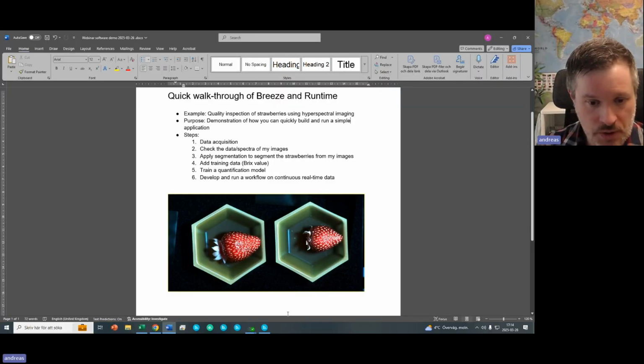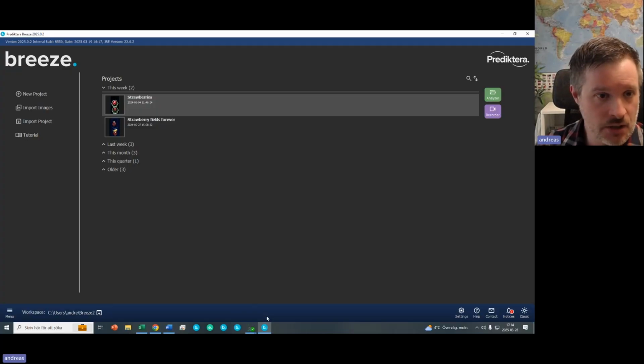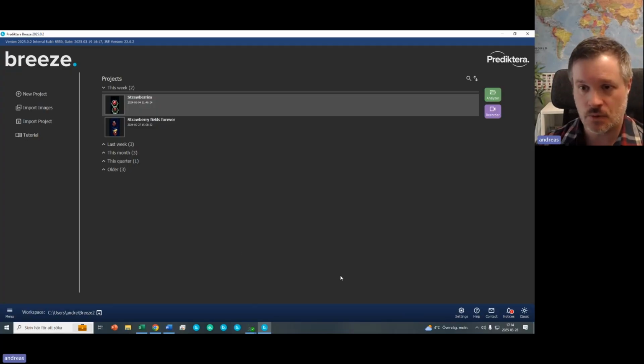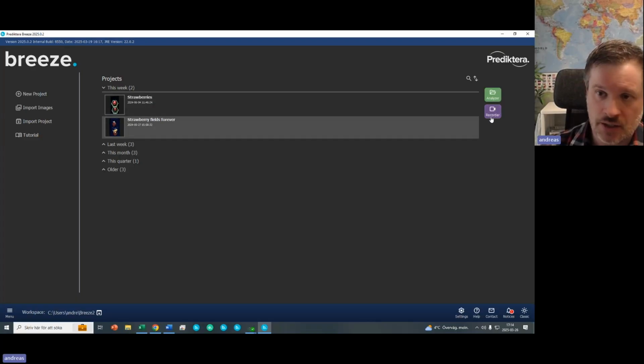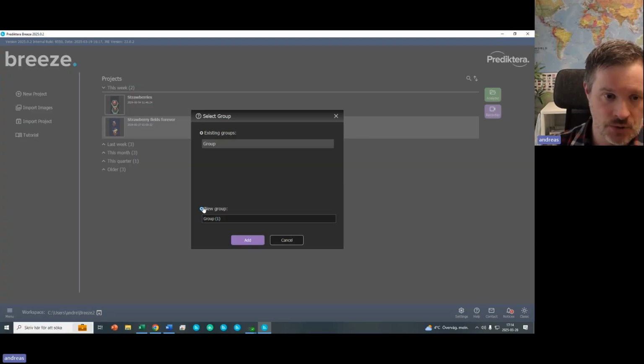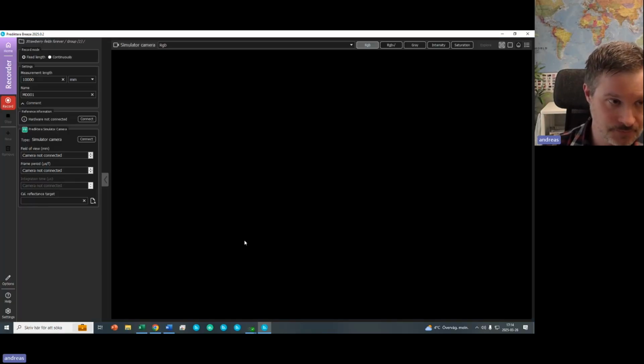So I will open up the software here. You should now see the Breeze software on your screen. Like I said, I want to start with data acquisition. Here are some projects that I have started already. I'm going to open this project here, and then press on the recorder. Now I'm going to do a data acquisition. So this is what that view looks like.